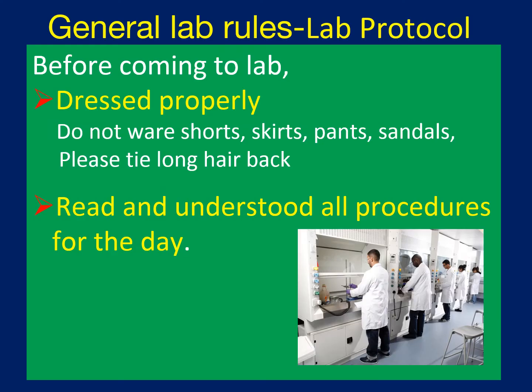So let's go to the general lab rules. These are things you have to do before you come to the labs. You have to dress properly. Don't wear shorts, skirts, and sandals because your body will be exposed to the chemicals, so you want to avoid that. If you have long hair, tie it back. Most of the time, what I have seen from undergraduates is that they are not reading any procedure for the given day. So please read and understand all the procedures for the given day. Keep that in mind.